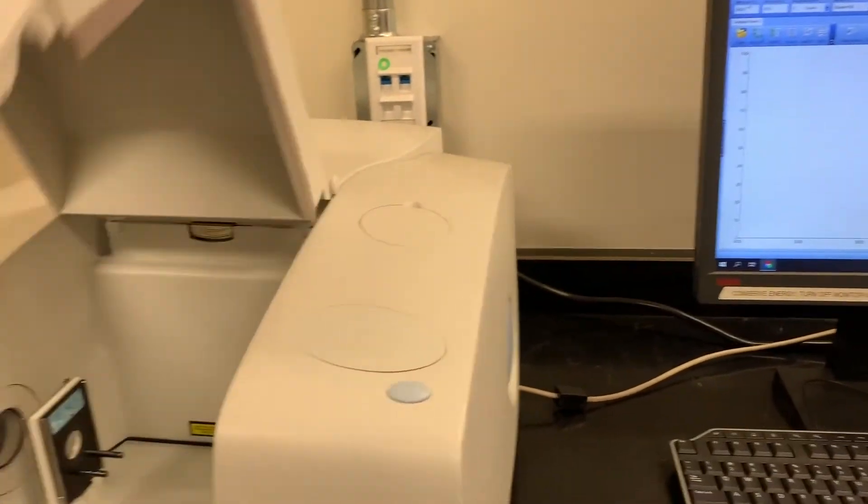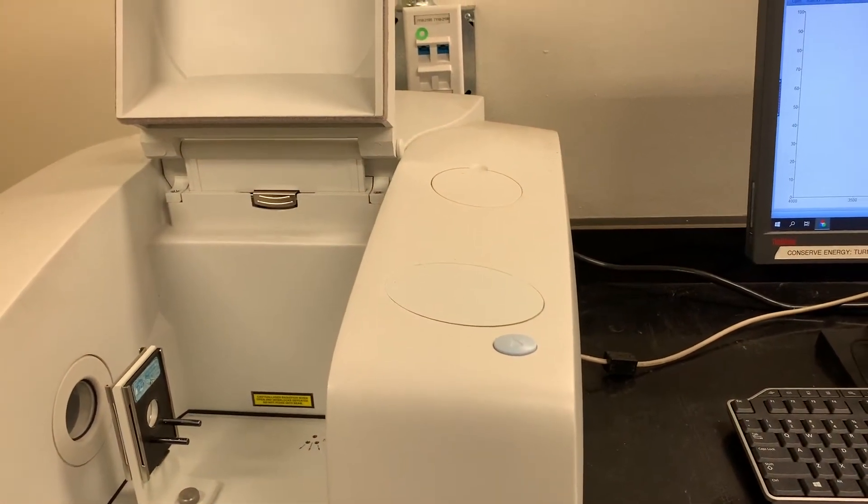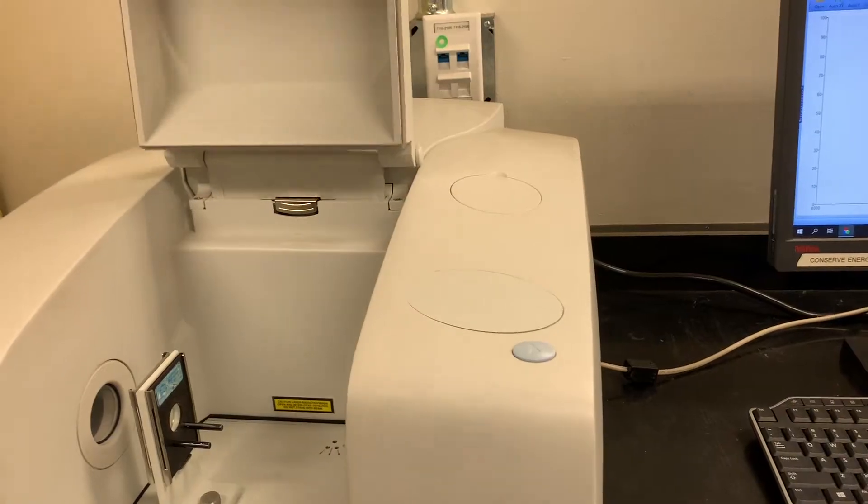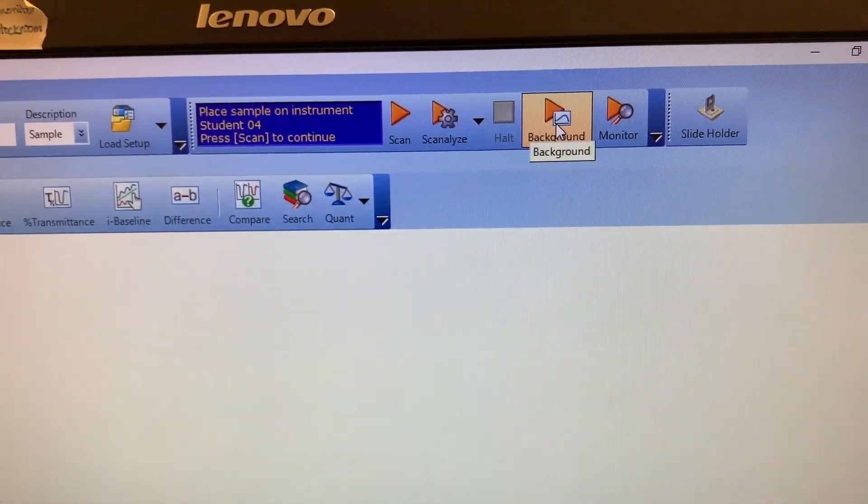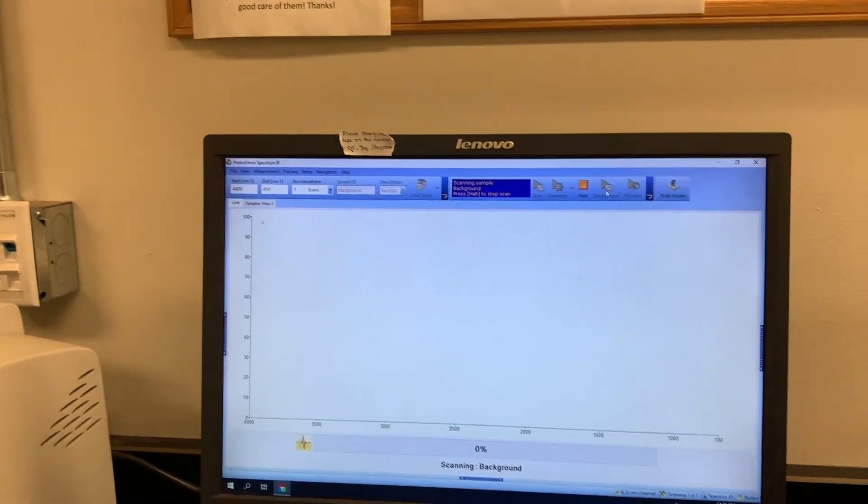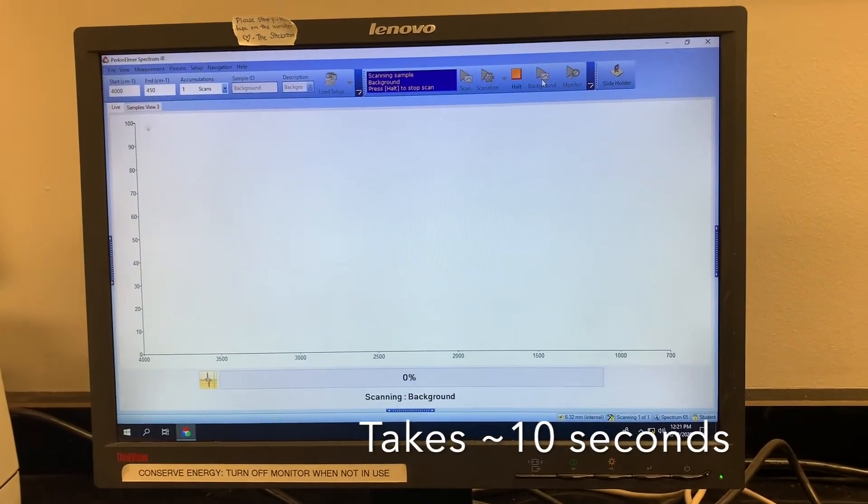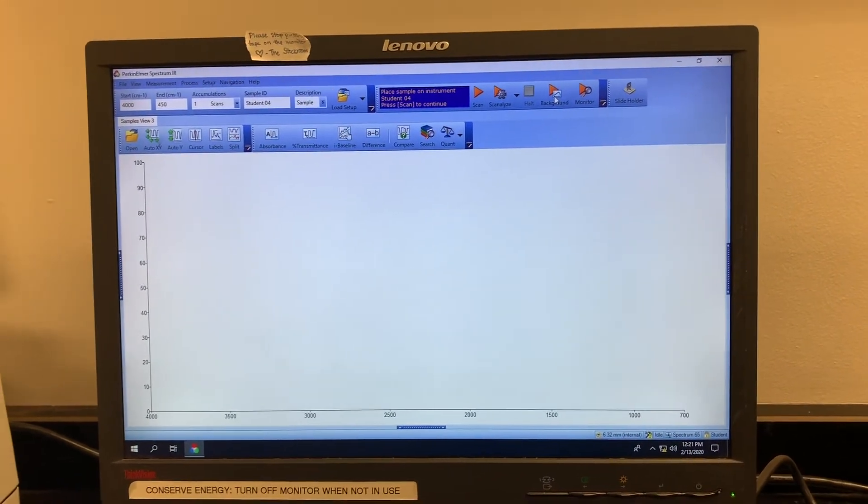So first we want to get a background scan. There's definitely CO2 in the atmosphere that will interfere with your spectrum. The software should already be open. There is a background button, you just click that guy after making sure it's empty in there. There, there's the background scan, and that'll just be deleted from your stuff.